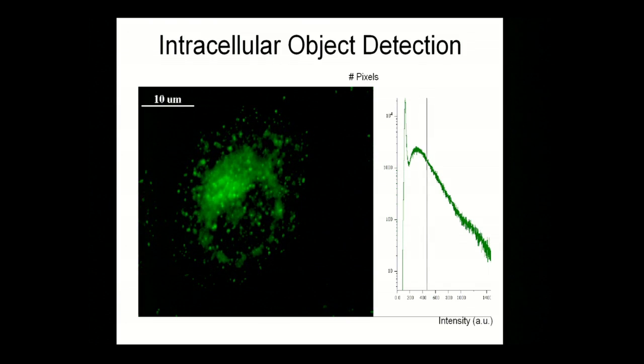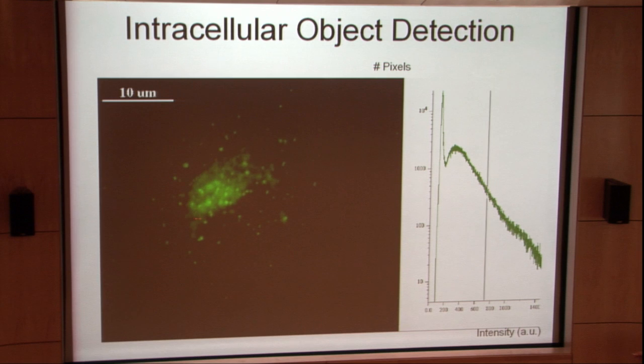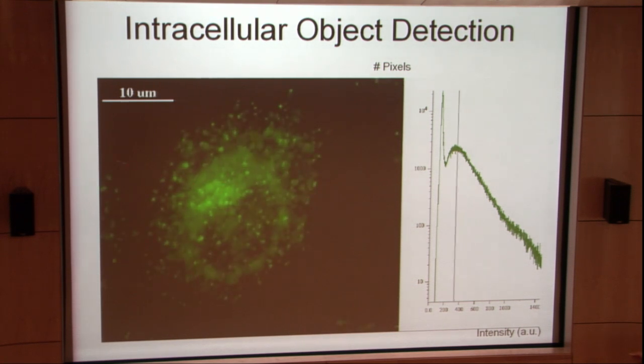If I go here, no. At this point, I see mostly the whole cell. And at the very end, I still see this part like a whole blob. It's not separated into single endosomes. And if I return here, I have background in the whole cell. Because of quite big background staining, I can't isolate endosomes in this way. So what can I do in this case?